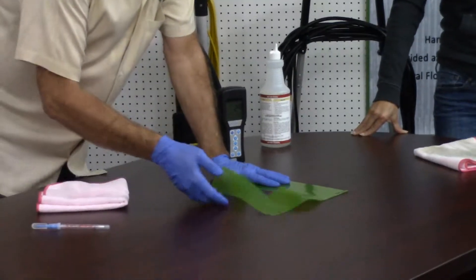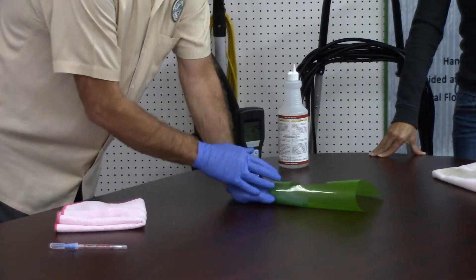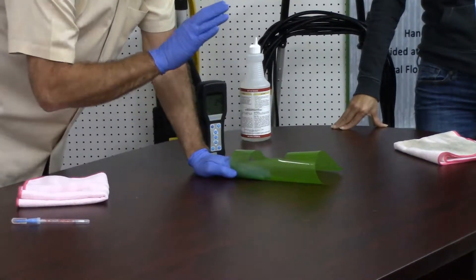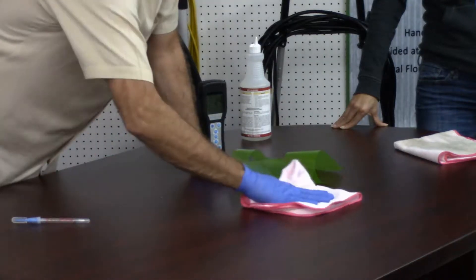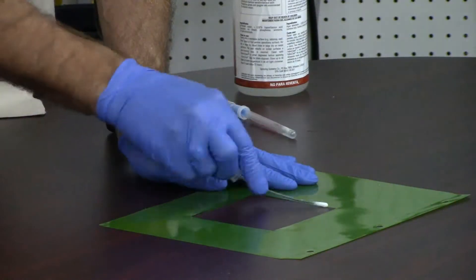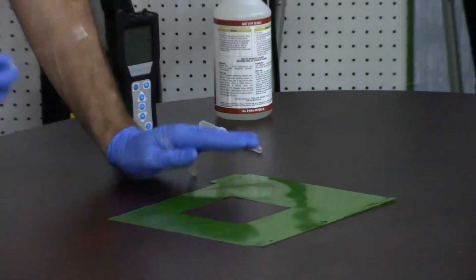I'm going to take this and lift this up. Notice I placed my hand here so this doesn't move — so when this comes back down, I'm going to test exactly the same place. I'm going to take this and wipe through here one time. Did I do about the same thing? Same area.